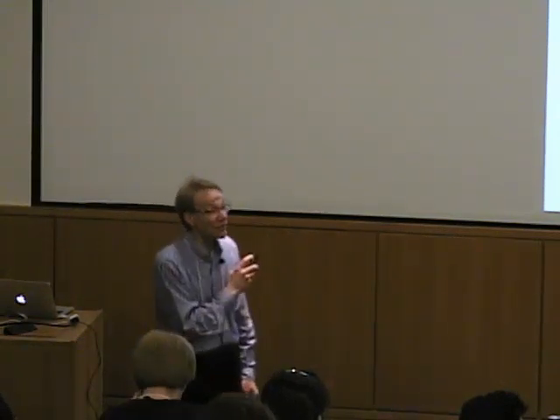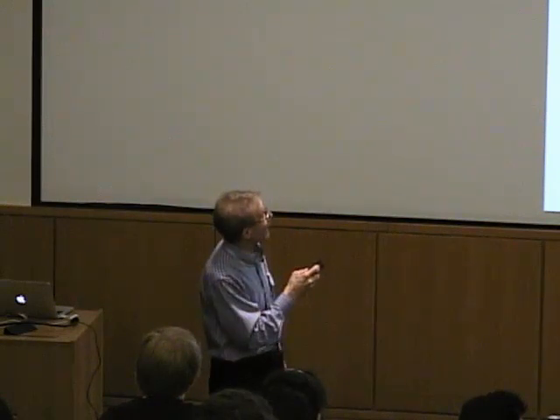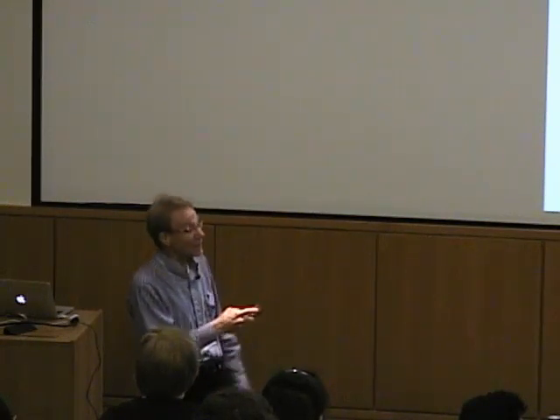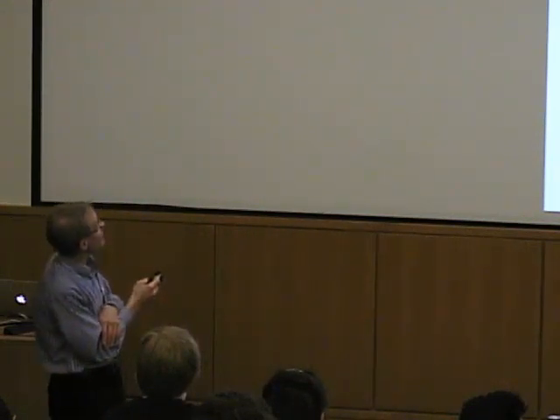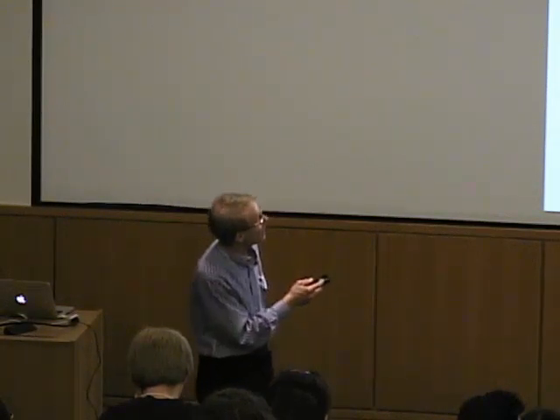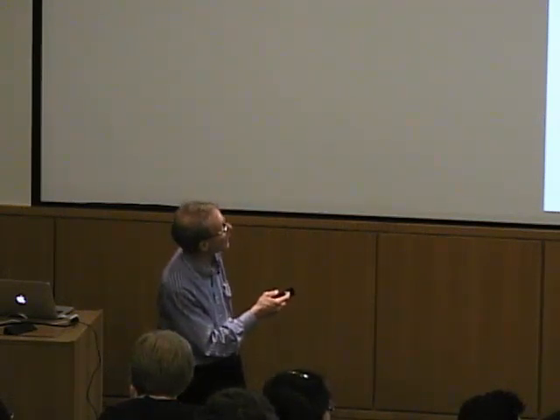Rachel Austin is very interested in one isoform of metallothionein, metallothionein 3, which is found in neuronal tissue, the brain. And we've been working with her. It's a little bit different than the metallothionein that's found in other tissues. A couple of key things. One is in this beta domain, there's these two prolines, which would affect the metal binding properties. And also there's this insert in this region, making the alpha domain a little bit larger.